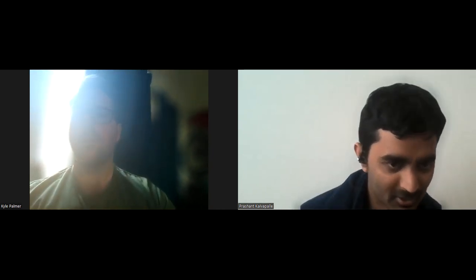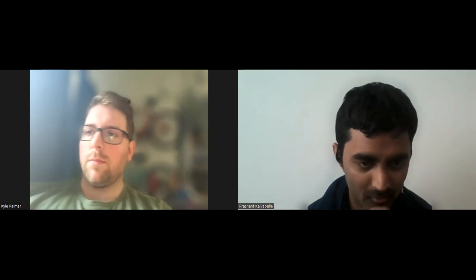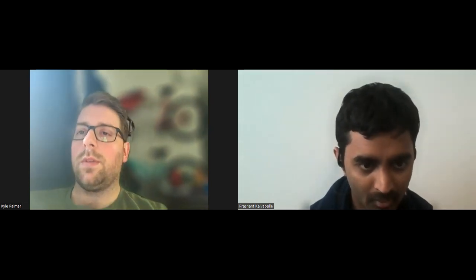If you're starting with this vial with the green cap that comes from Twist, we can check how much mass it has and how much we resuspended it in. Usually when I resuspend it, I write the volume on the side, or I write the nanograms per microliter it has been resuspended to. That way in the future, if you come back after 6 months and open the same old vial, you know the mass per volume. So we can just start from that and calculate. Cool. Sounds good.